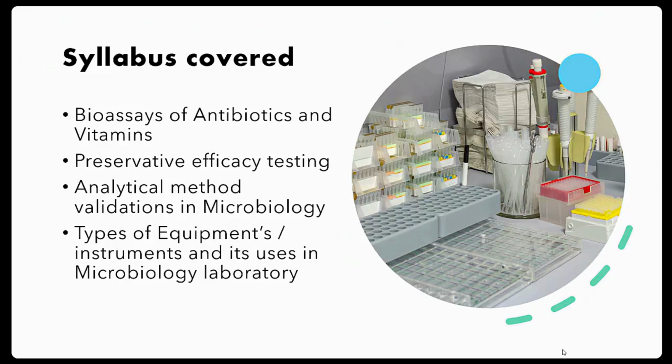Next, preservative efficacy testing. This is also called antimicrobial effectiveness testing. We will check whether the preservative which we added in the drug product is working throughout its life cycle, its shelf life, or not.